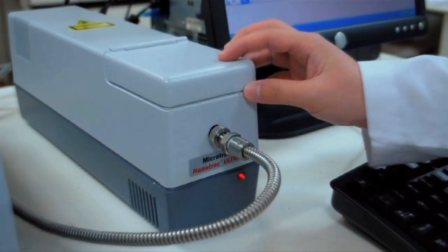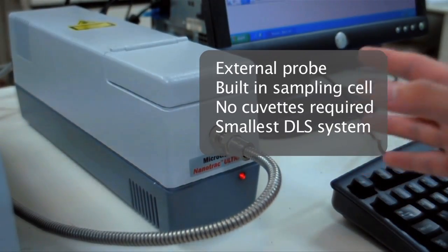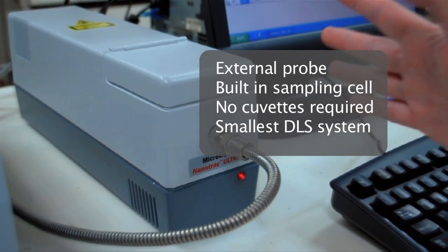The Nanotrack is the smallest and lightest dynamic light scattering system that is commercially available in the market.